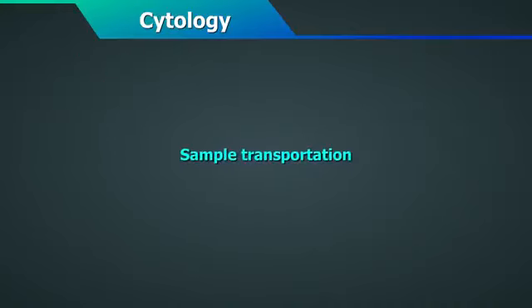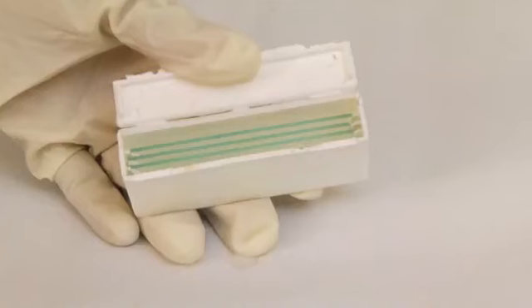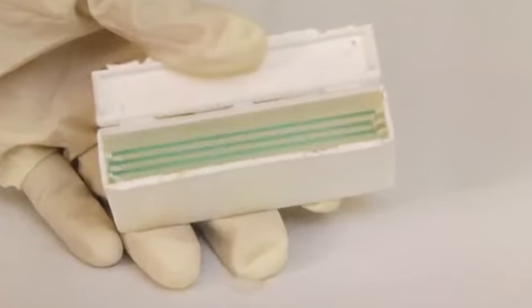Sample transportation. Slide mailers are most suited for sample transportation. Well-fixed, adequately labeled slides can be safely transported using slide mailers.